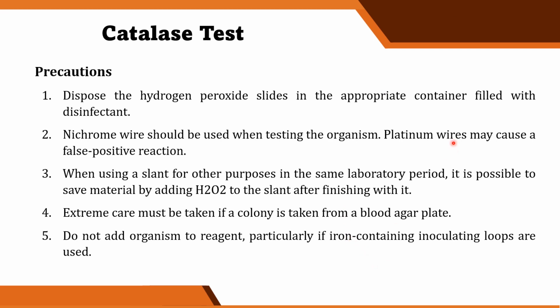Iron-containing loops also cause false positive results when exposed to hydrogen peroxide.